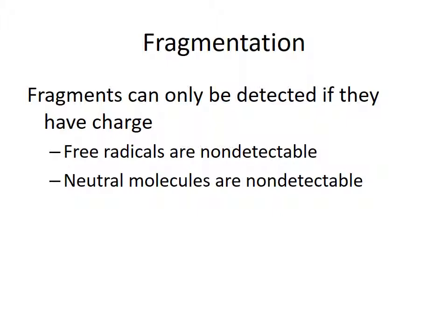Fragments, though, can only be detected if they have charge. The free radicals that go flying off, or neutral molecules that go flying off, are non-detectable. All we can detect is what's left behind of the carbocation. Remember this, because this will help you decipher the structure.